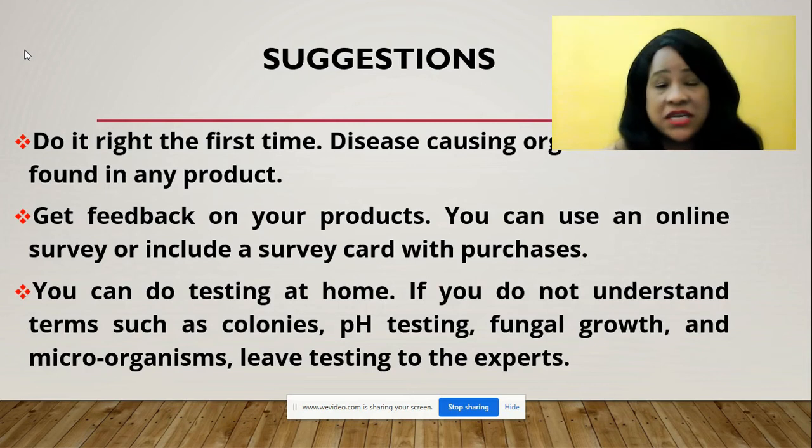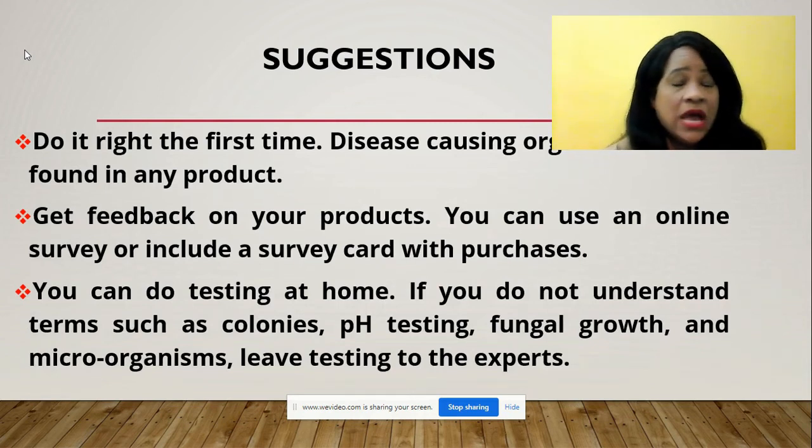So here are some suggestions that I'm offering to you, and these are only suggestions because I'm not an expert. My first suggestion is do it right the first time. Disease causing organisms can be found in any cosmetic product.